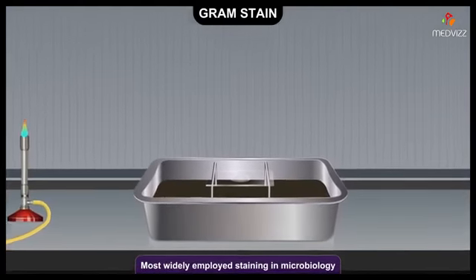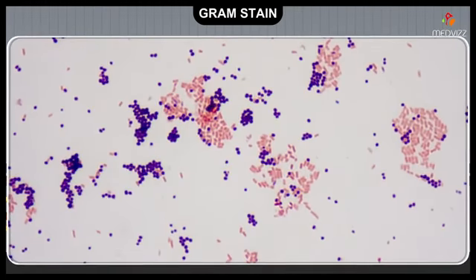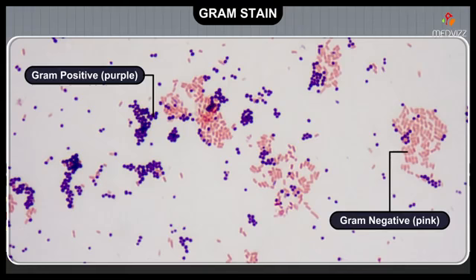Employed staining method in microbiology. It is a differential stain because it divides bacteria into two classes, gram-positive and gram-negative.